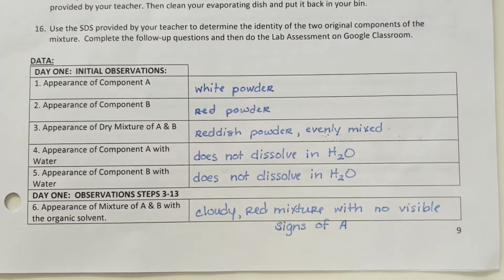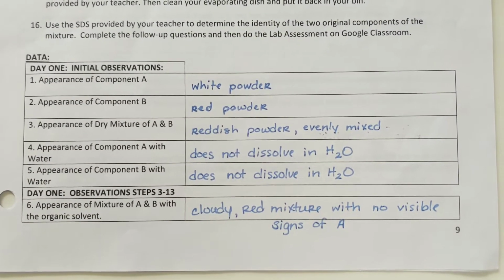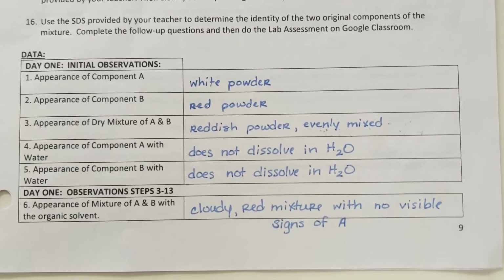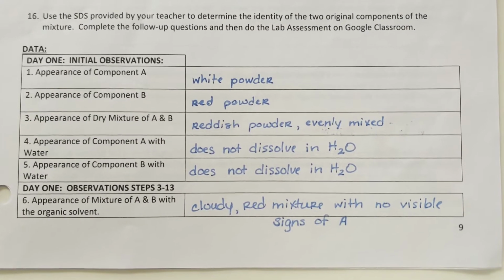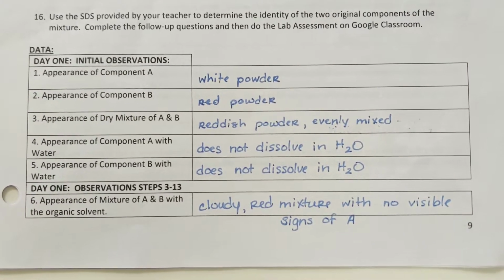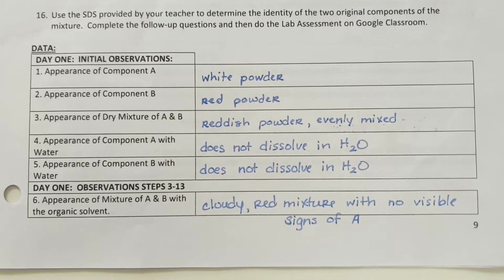The mixture was reddish, which shows us that we definitely have B in this mixture, and A was hard to see, so this mixture was very evenly blended. That's going to help us in the future with interpreting what type of mixture we were looking at.